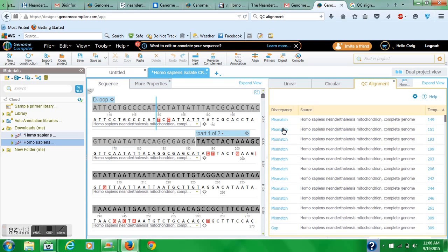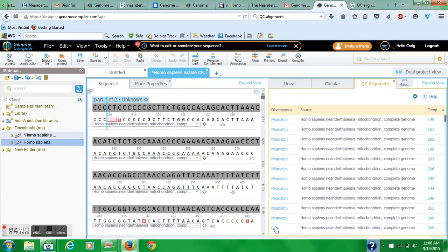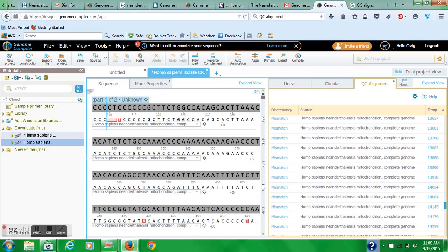Due to the age of the sample, the sequencing is imperfect. There are gaps in the genome that can be seen in visualizing the sequence data. This data allows scientists to infer phylogenetic relationships and help to answer questions in evolutionary biology.